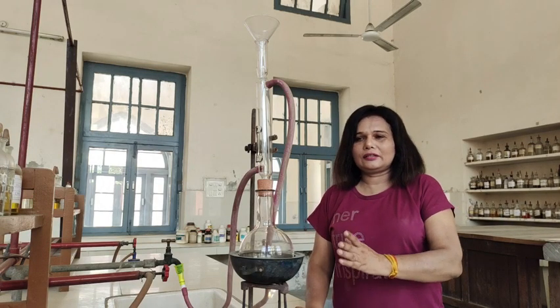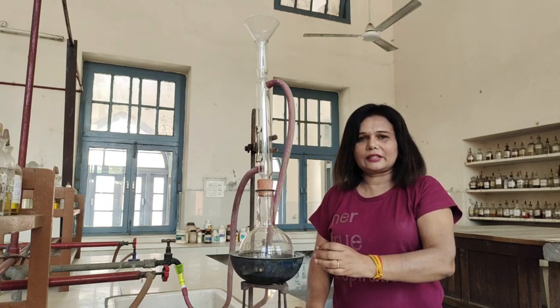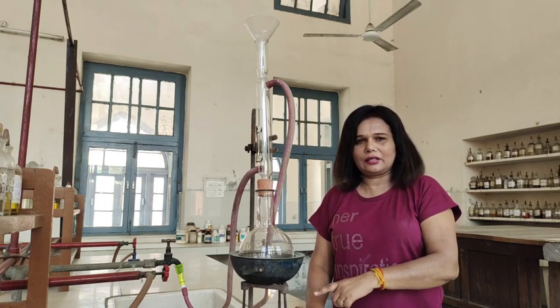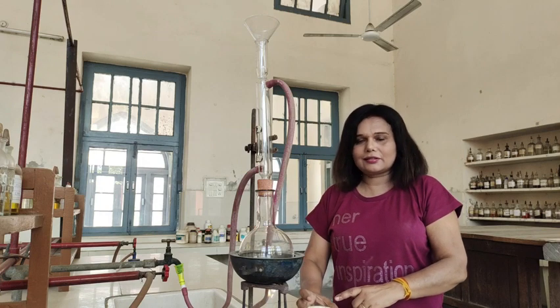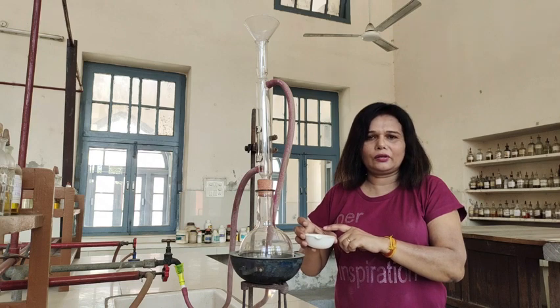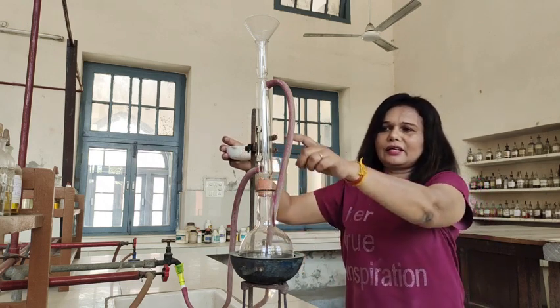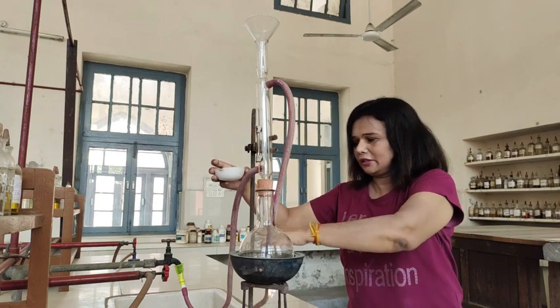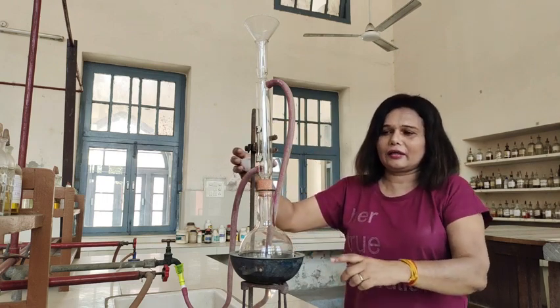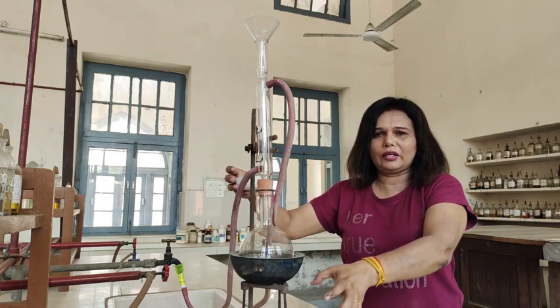Now you will see the setup of the apparatus for the recrystallization of iodoform. As we already saw, we dissolved the crude iodoform in ethanol, that is, ethyl alcohol. Now we'll transfer this setup. This is the round bottom flask, this is the condenser which is connected to the tap water and the exit, and it is contained in a boiling water bath.